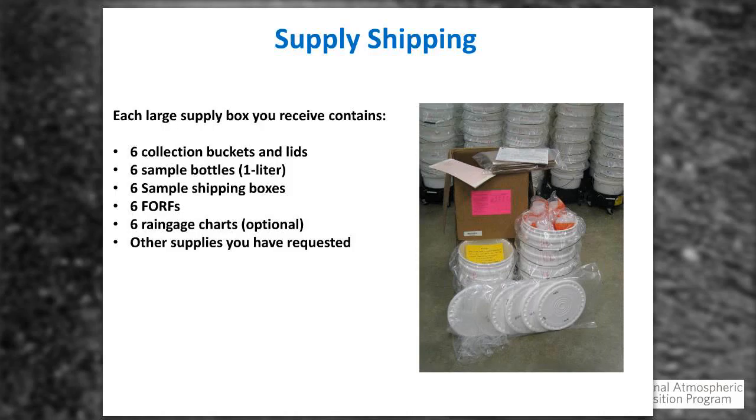Just a couple notes. It's hard to see at this scale, but there's a nice bright pink label. Please complete that. That helps us keep your site supplied. It lets us know the inventory you have and helps us to adjust supplies appropriately.